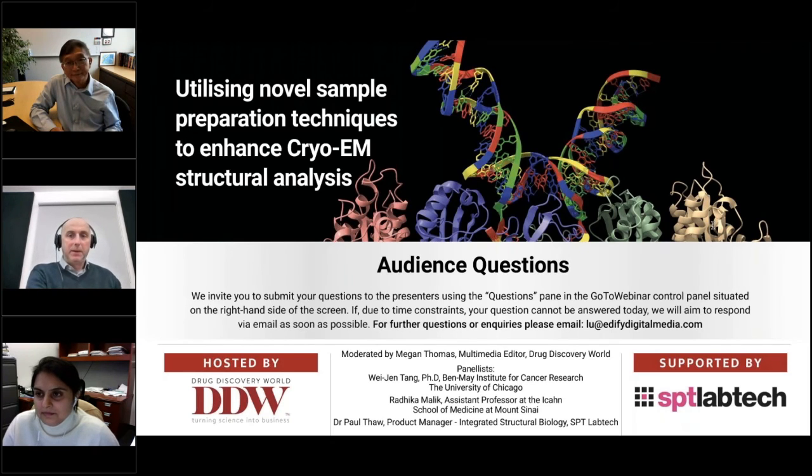Yeah, agreed. Okay, I've got some very eagle-eyed audience members today. Another question for Radhika. It appears that the 2D averages show side views in both the Vitrobot and chameleon grid. Why does the Vitrobot image produce such an anisotropic map? Have they misunderstood that, or is there a reason for that, Radhika?